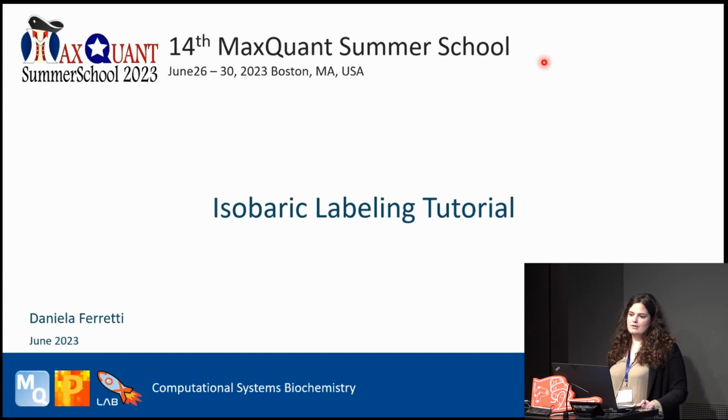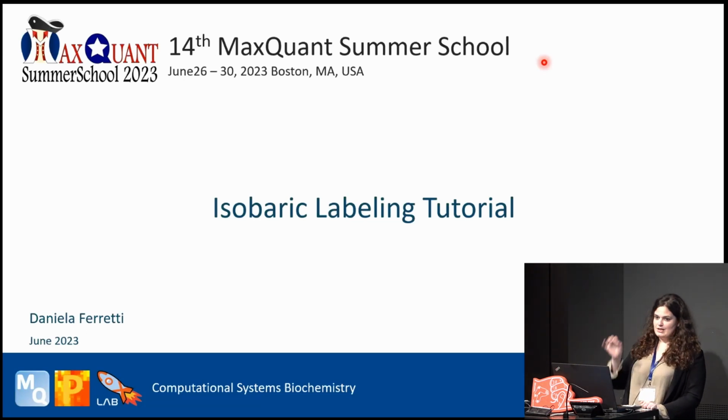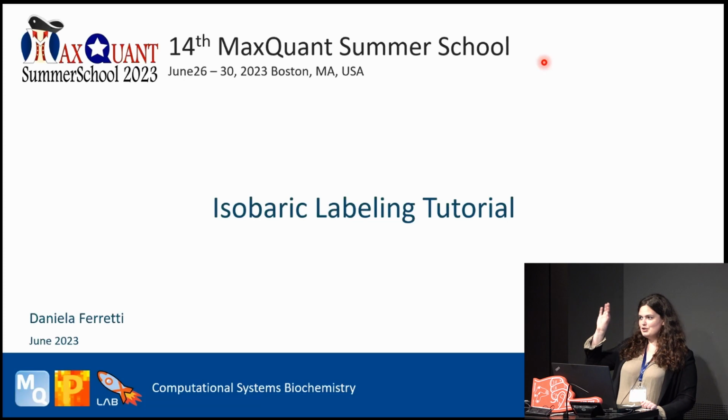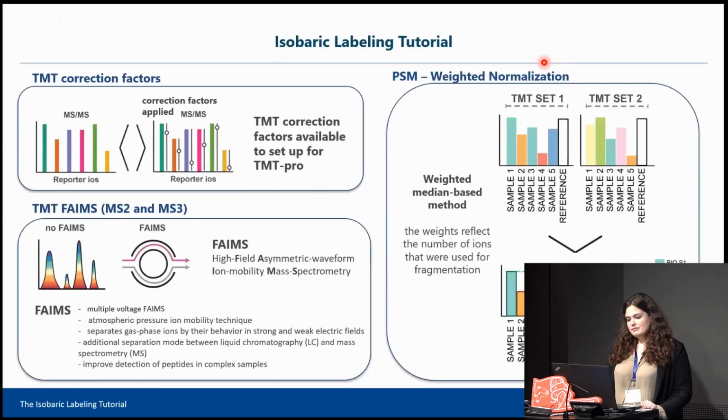So we prefer to keep the slides for now, so that you can go together, see the workflow together with me, or what I apply. But don't worry, you have all the data, MaxQuant output, Perseus session, MQ par file on the USB drive. Together with that, you also have the PDF, so all the steps that you see now are actually more detailed there, exactly each button that you have to press, in a way to do exactly the same process. So we will start now with the first tutorial.